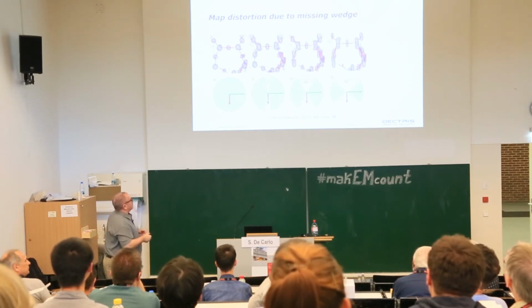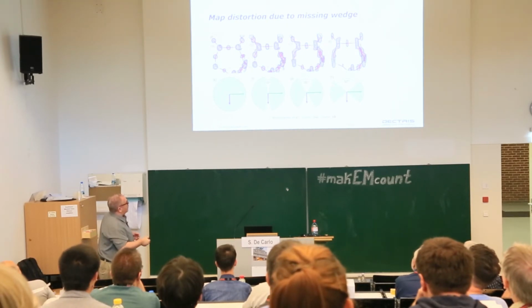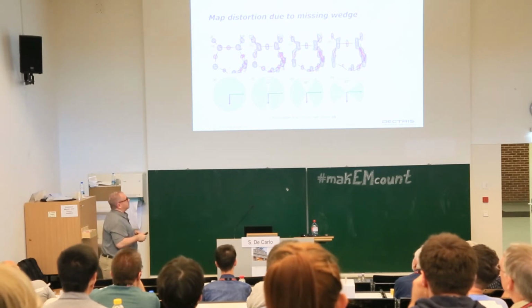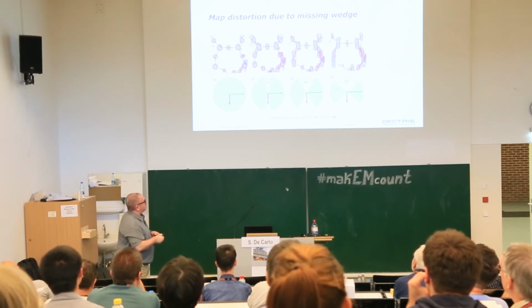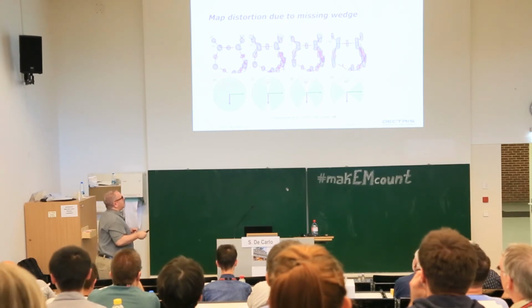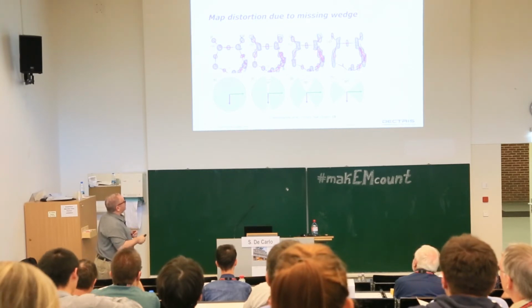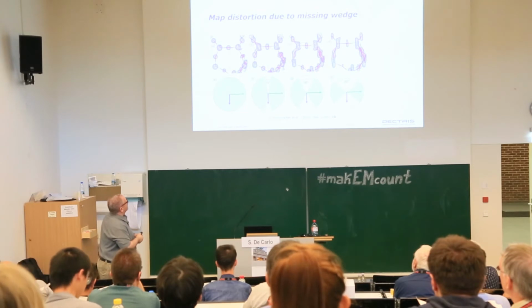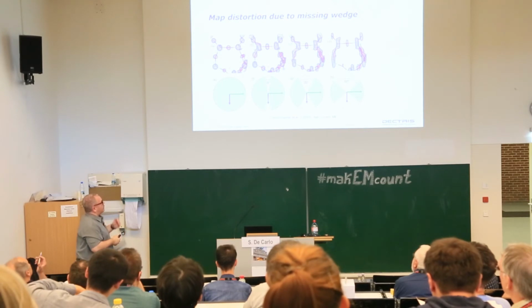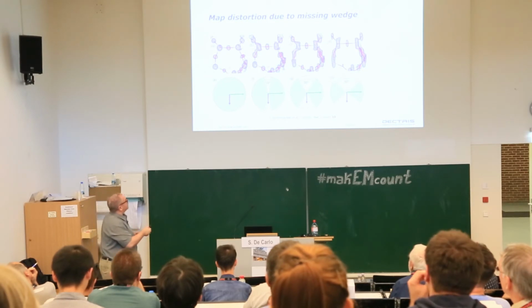The idea of merging these 2-3 data sets is illustrated here. If you have only one data set, you might get the density, as I said, which is not precise enough to do atomic assignment, and the angular completeness is also reduced. As you increase the number of data sets that you can merge, or you cover a better angular space, the densities become better and better, and in the ideal solution you get really precise densities where you can do the assignments quite easily and also automatically, depending on the software you are using.